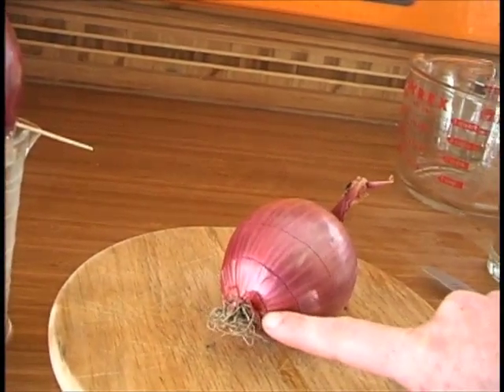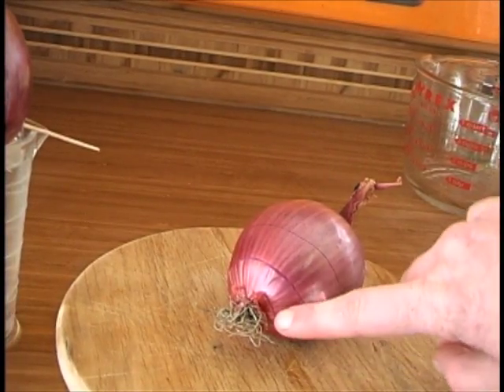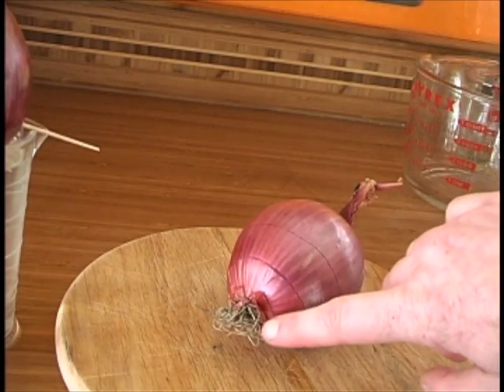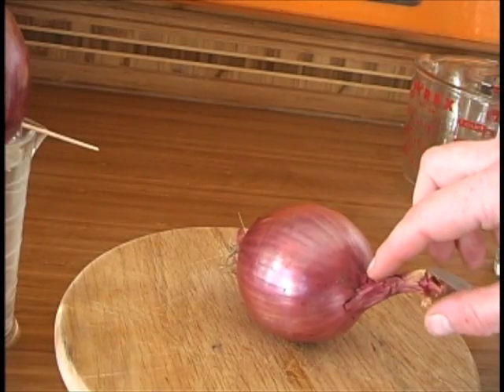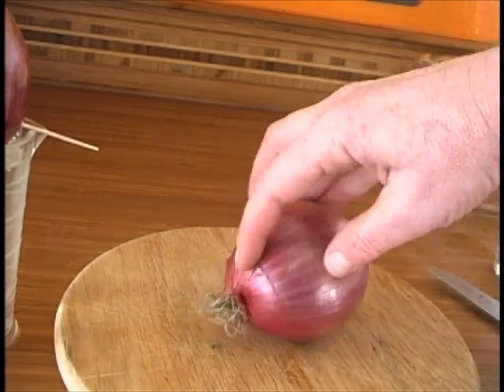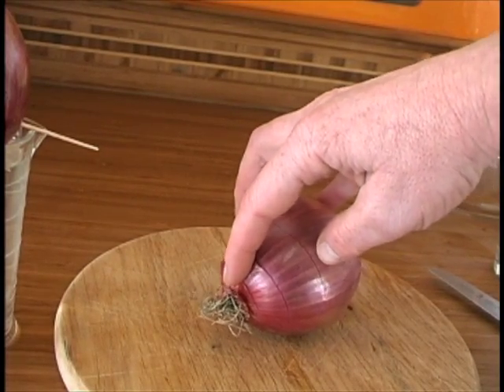If you don't have visible roots on your onion, it's okay. Just look for the bottom of the onion where the roots used to be. Don't cut on the side of the onion where it would sprout — cut down near where the roots are, or where the roots used to be if they've been pulled off.